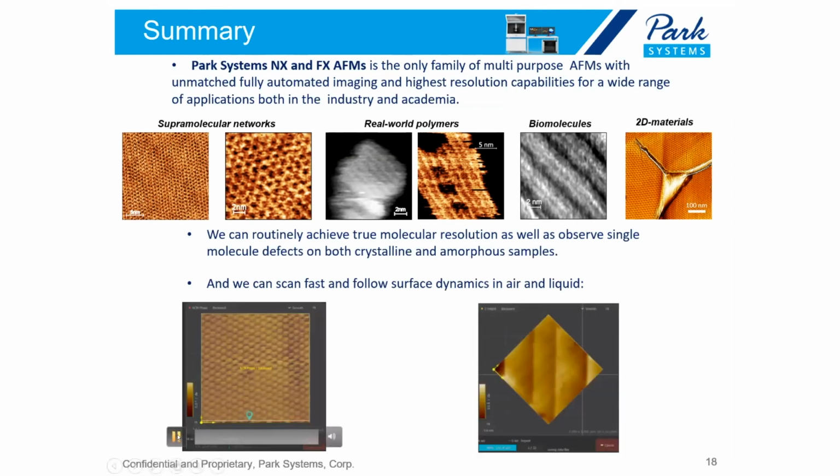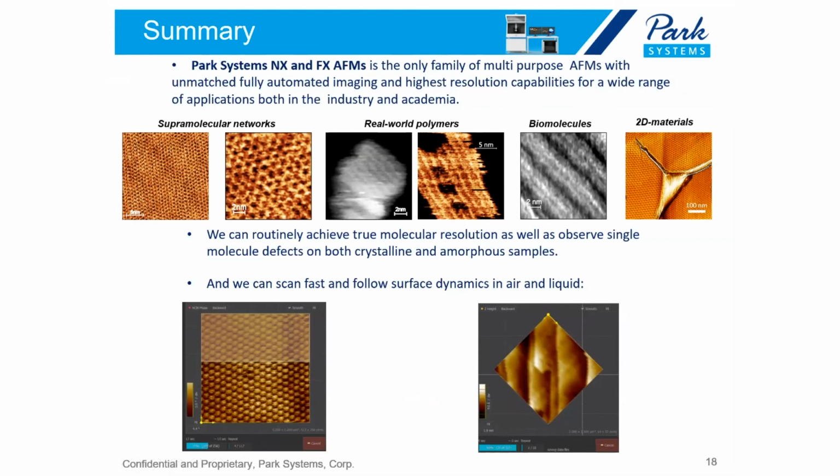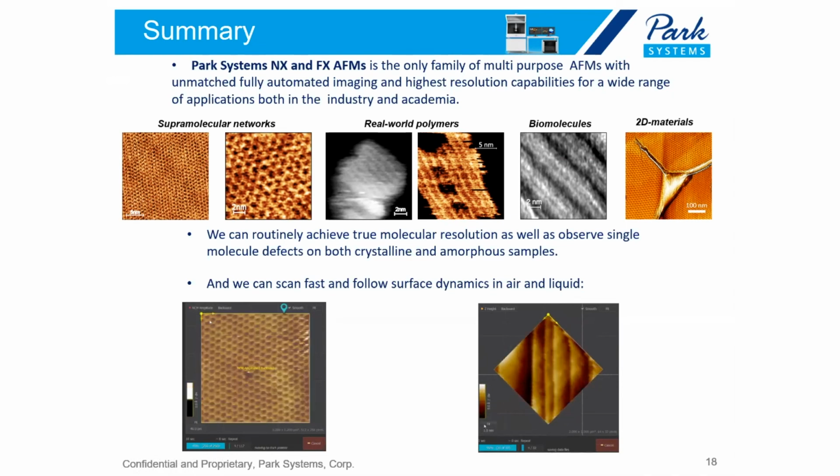And here are two videos. One is showing how we can scan the moiré pattern on graphite, and I'll just cut there. And the other one is how we can follow the dissolution process of a gypsum crystal in water. Those two videos demonstrate a few very important principles of AFM. It provides you with real space imaging. You see what you image. You can follow the dynamics of the imaging in real life, in real time. So that is very important.